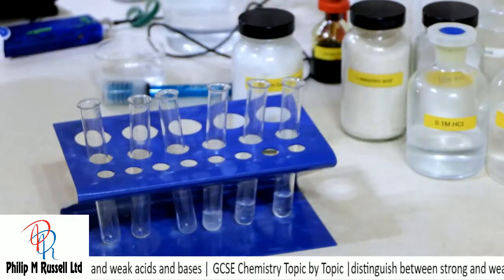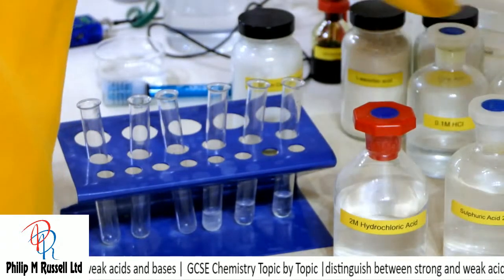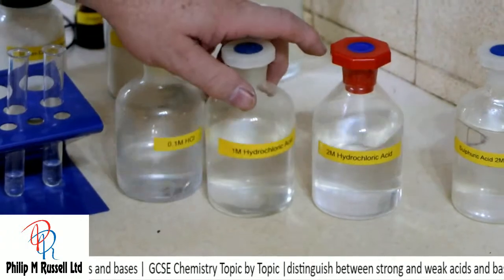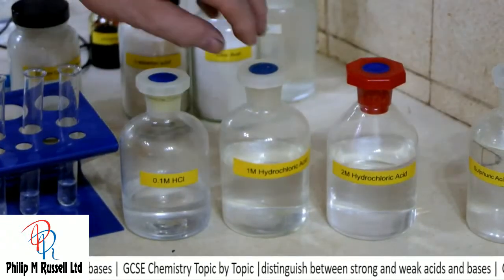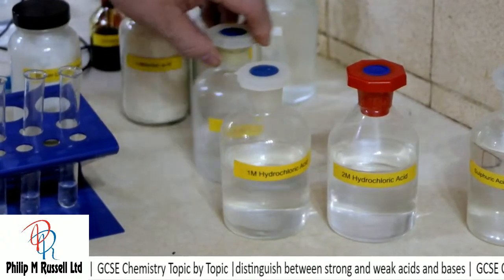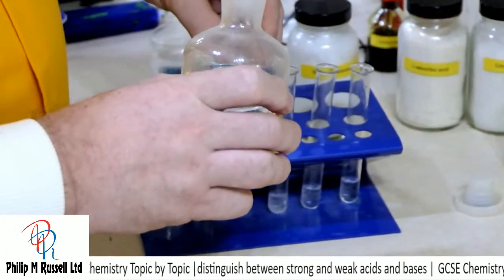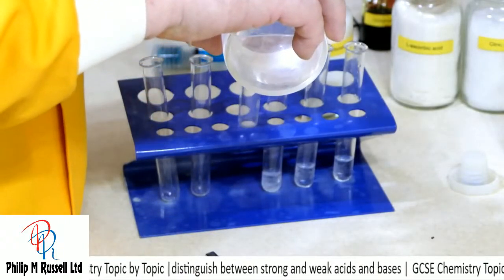So let's now try, if there's not much difference between the reactivity of the mineral acids here, let's try and compare that reactivity with different strengths. I don't think we're going to see much difference between the 2 molar and the 1 molar, but we might see some difference between this and that. We might. So let's have a look. We're going to start off then with some 1 molar hydrochloric acid.